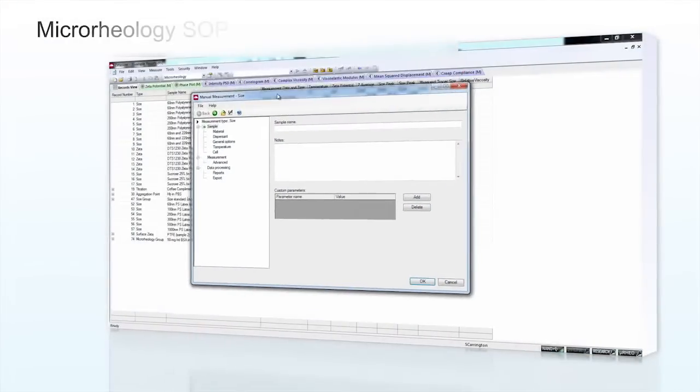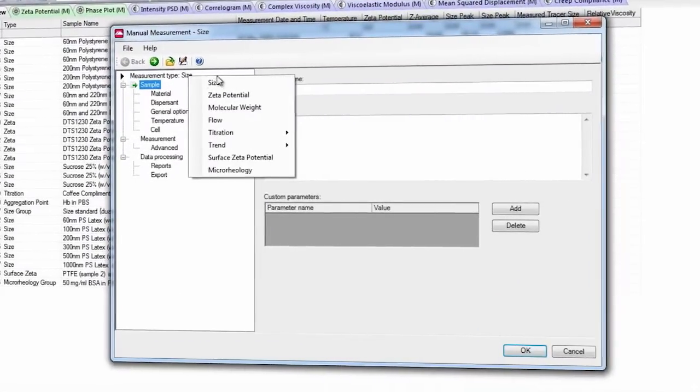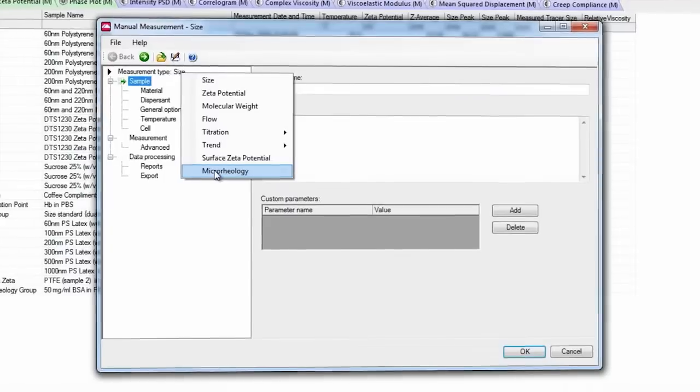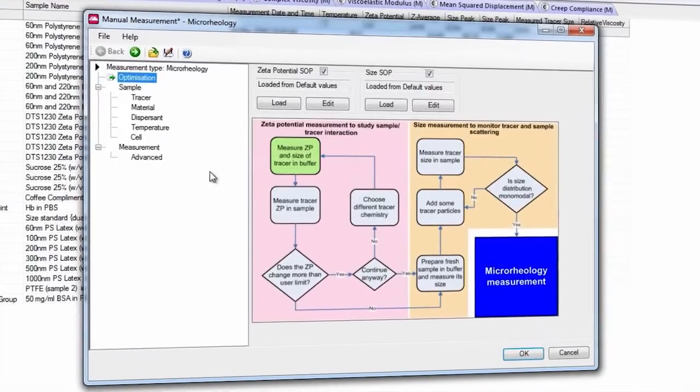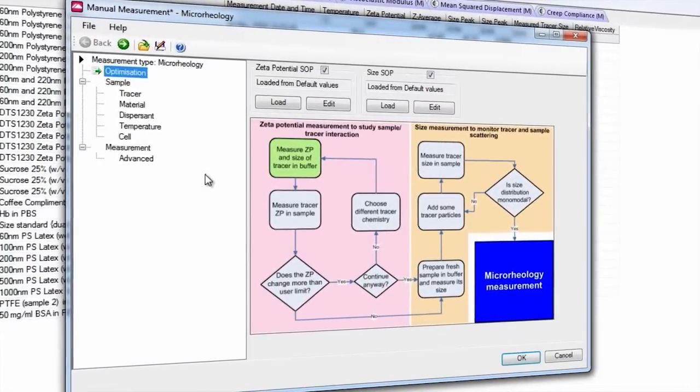A microrheology standard operating procedure or SOP is provided in the software along with full user guidance. The microrheology SOP is configured with pre-measurement tests to assess the compatibility of a particular tracer particle and sample combination.